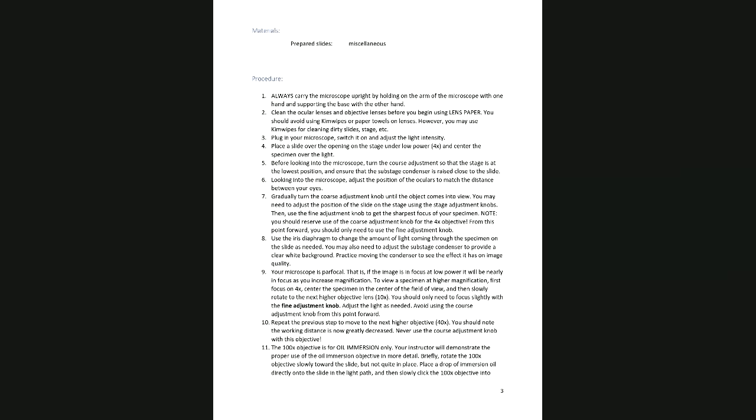We could loosen the clips. Yes. Right, so there we have what students most commonly do, which is lower the stage to take the slide off. I don't know why you're told to do that, because here's the thing. So you just put this slide on, right? You found it, you focused, you went all the way up to oil, everything's good.